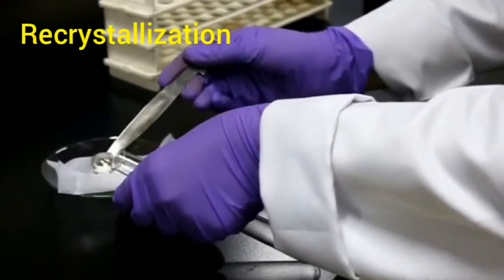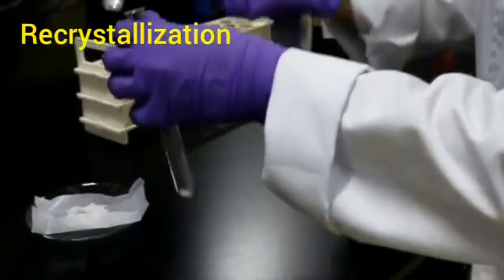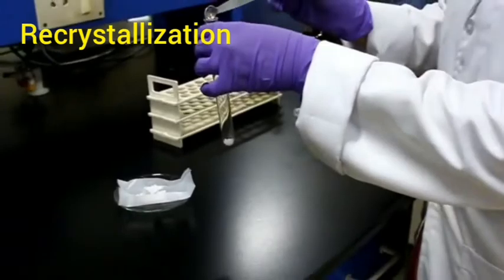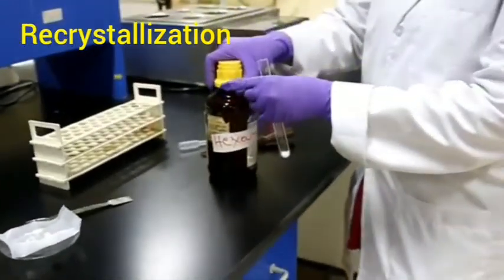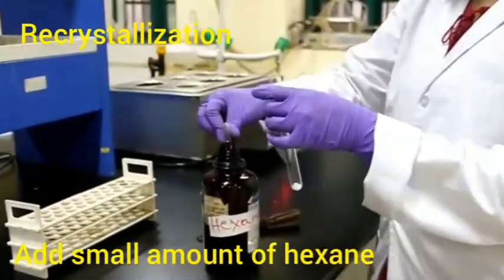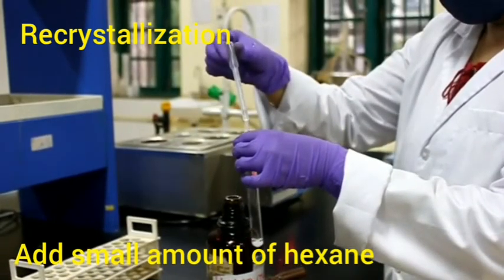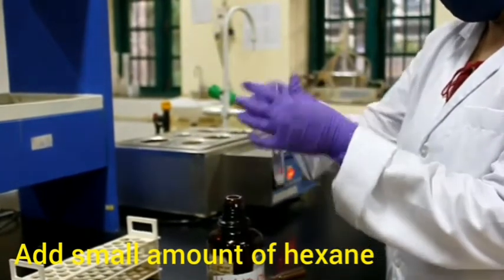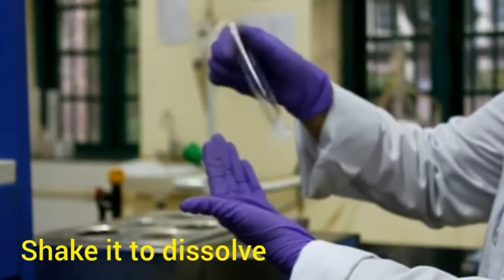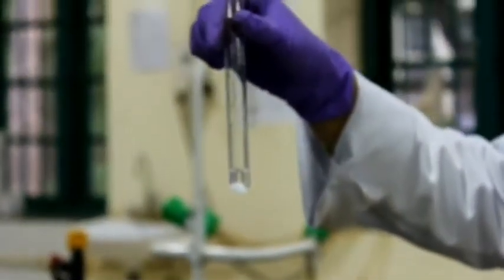For recrystallization of the product, we took a small amount of the product, benzophenone, in a dry test tube. Then we took a small amount of hexane to dissolve the compound. We need to shake the test tube to dissolve the compound, but the compound is not dissolved.